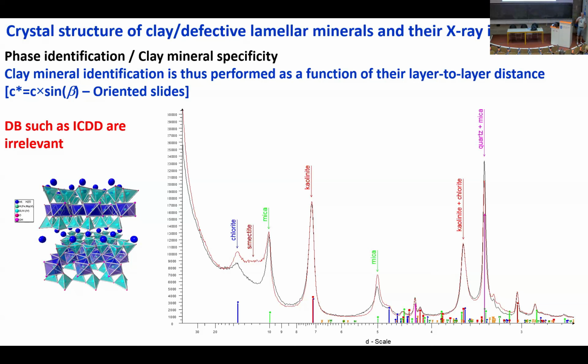Here you wanted at first to remove most of these periodicities, which means that databases such as ICDD are just not relevant for clay mineral identification. Most of the peaks that are shown here are just not present in the diffraction data I recorded because I wanted at first to exclude them by preparing oriented slides.